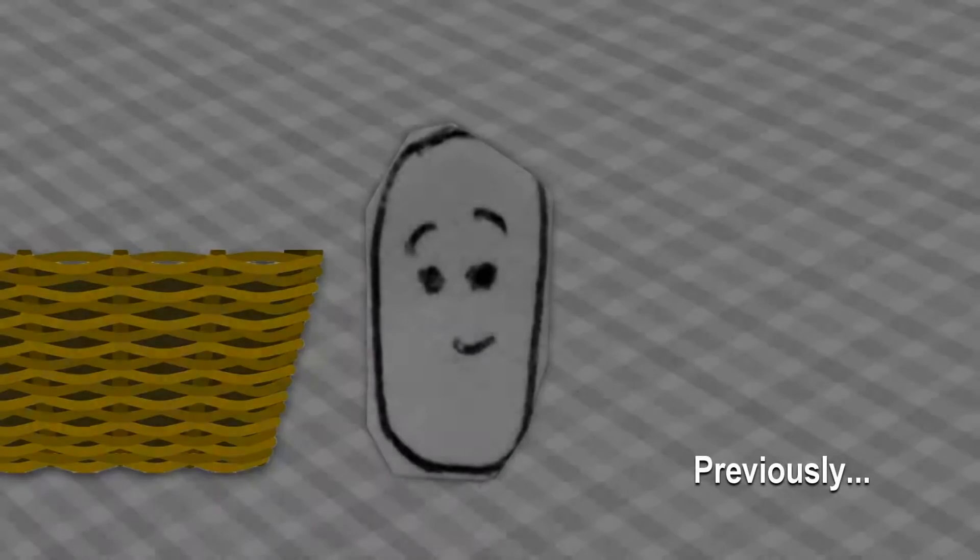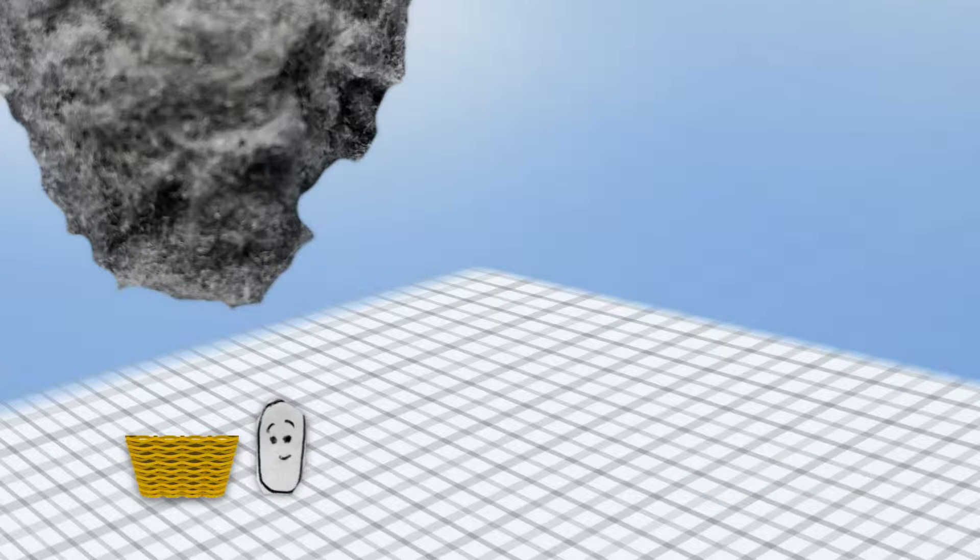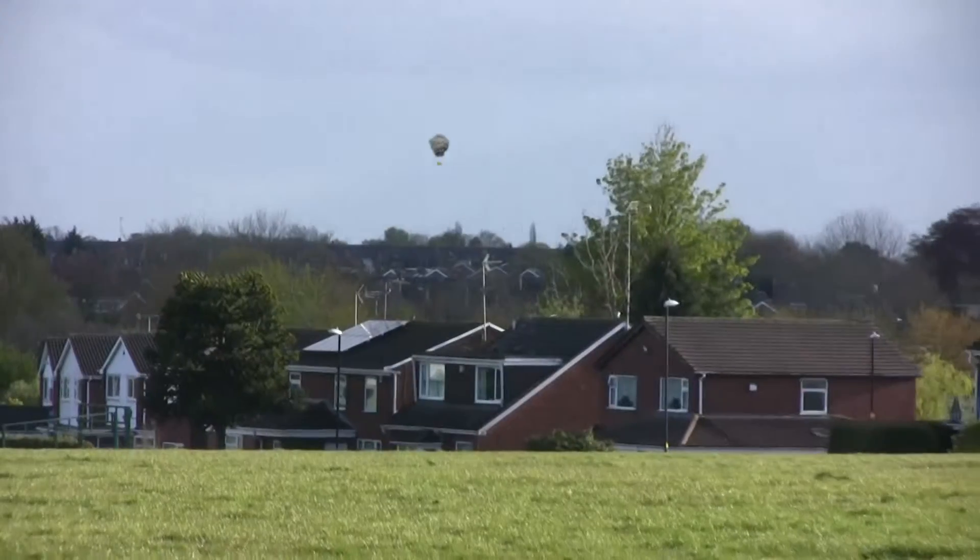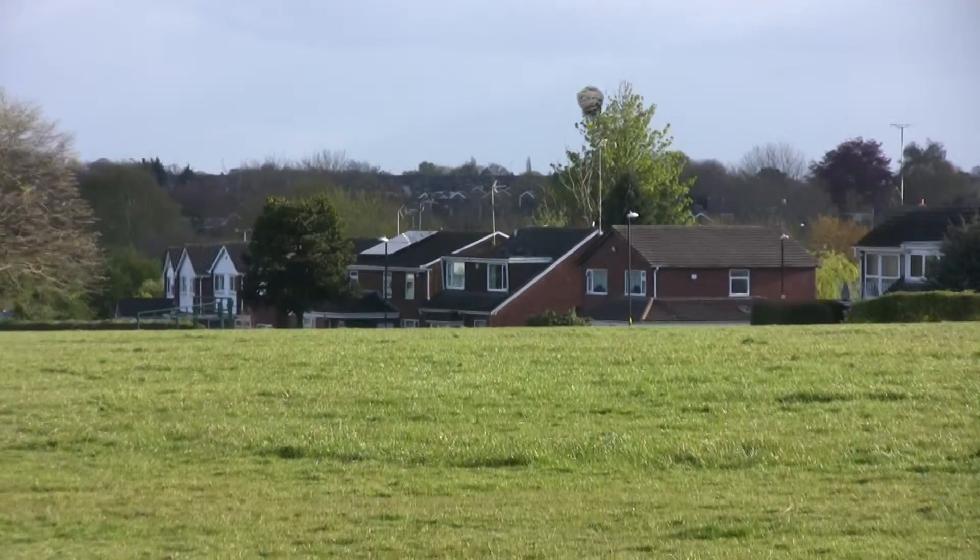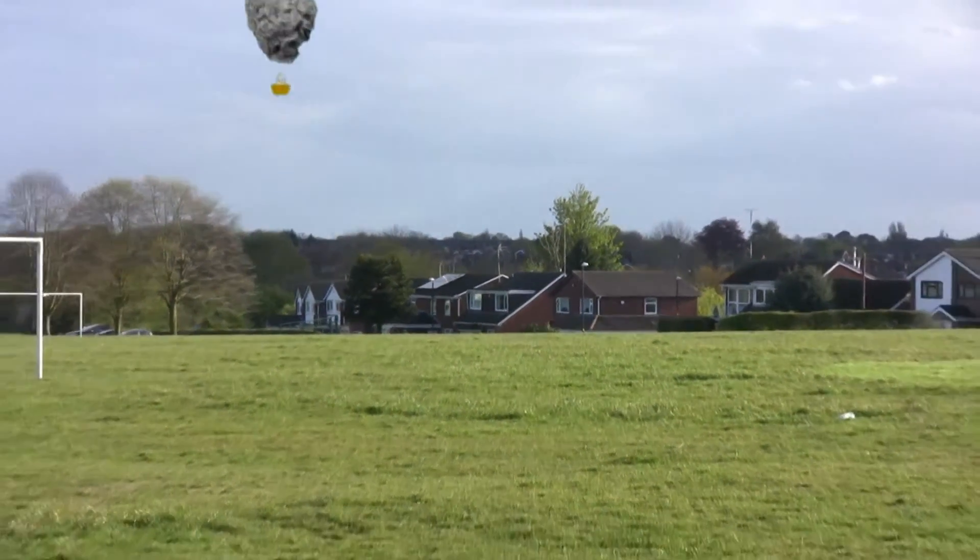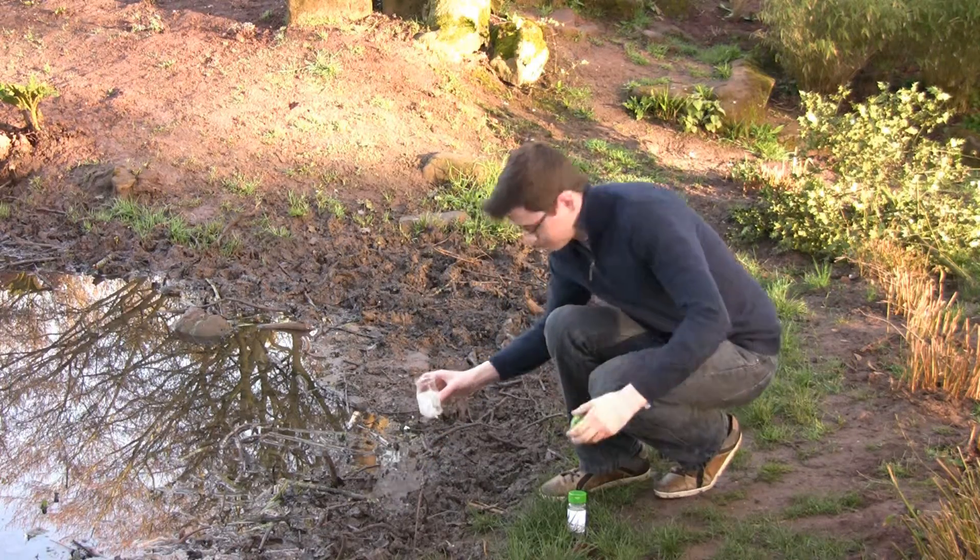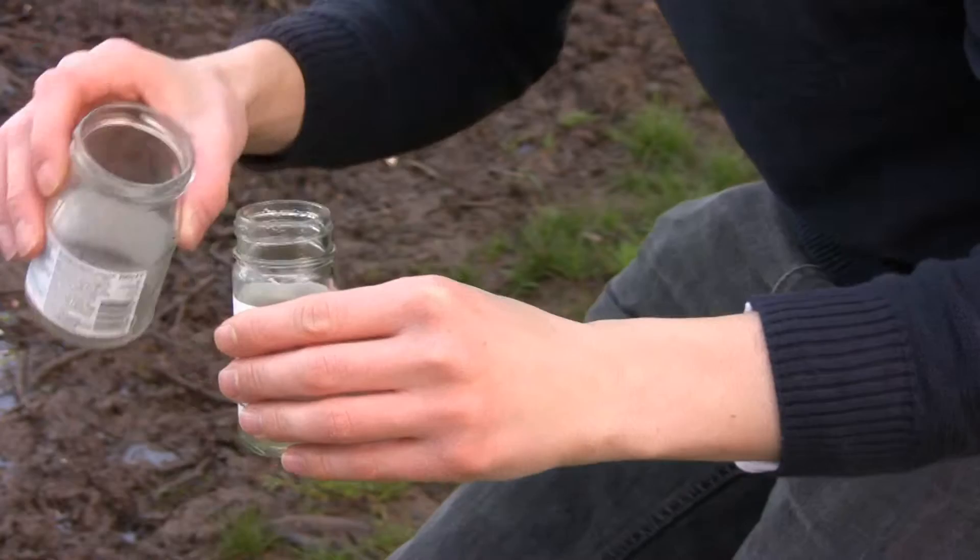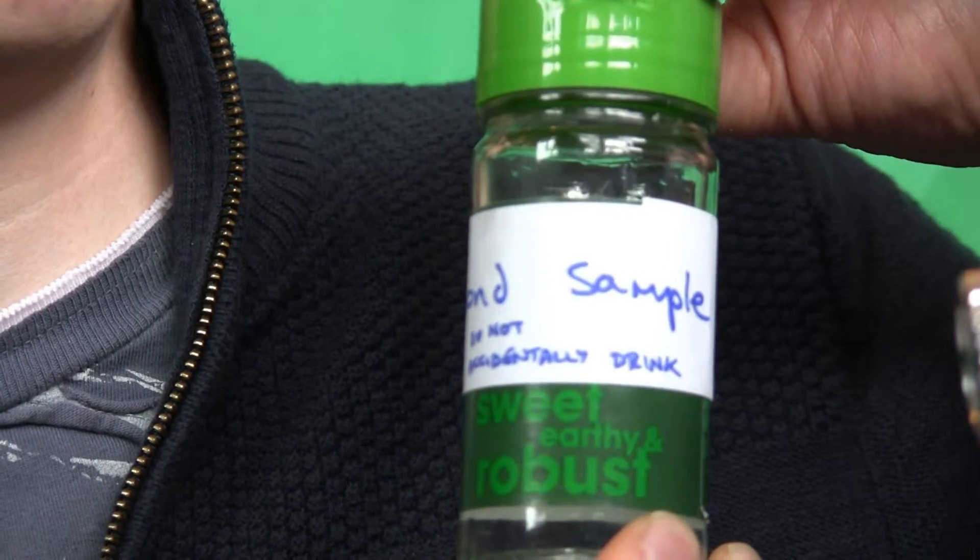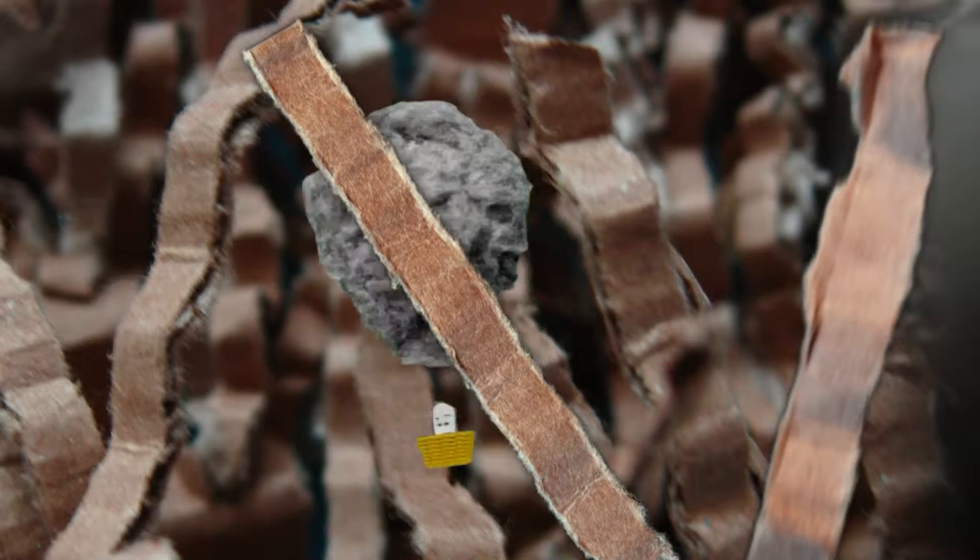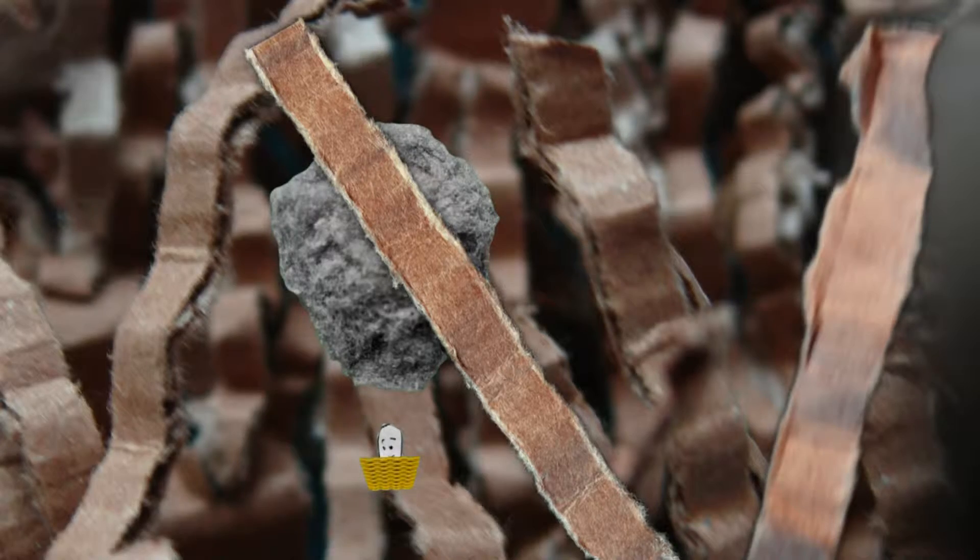Previously on Theo the Tiny Bug, this is a dust balloon. This is the best big adventure ever. It's Nathan. I thought I'd come and get a sample of pond water to investigate under my microscope. Oh, I seem to have landed in your hair. What?